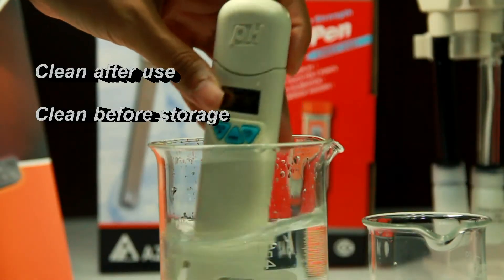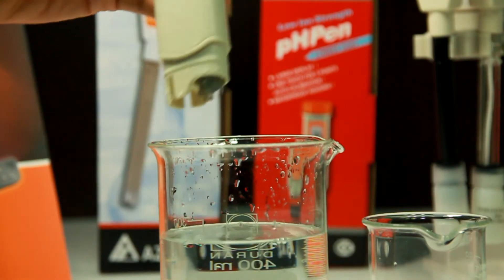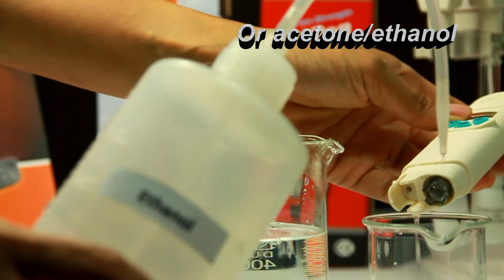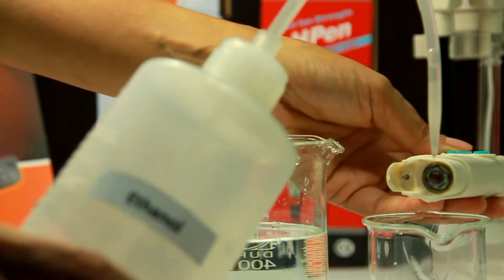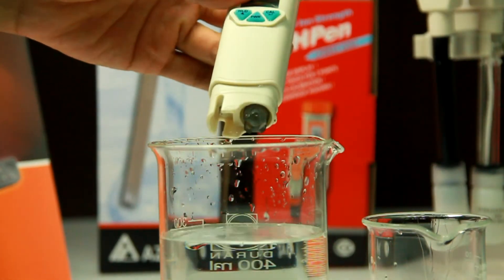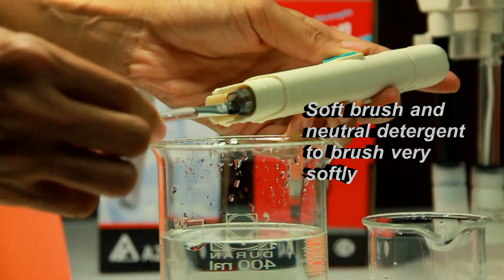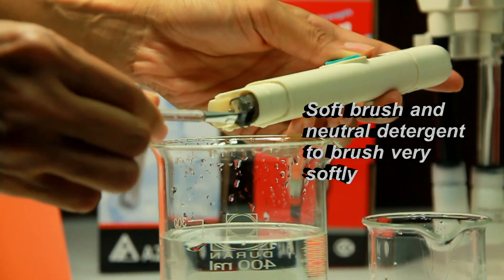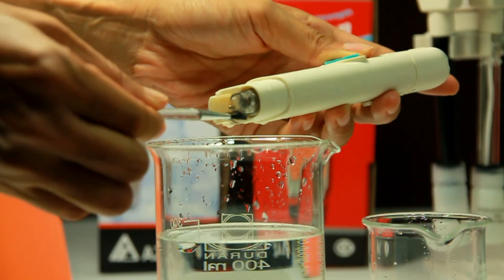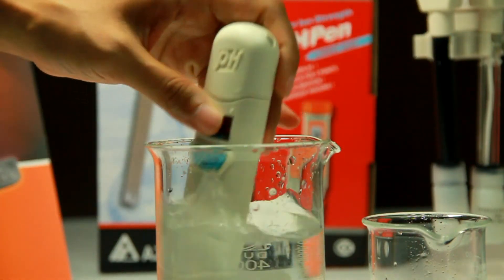Always clean the PH electrode before storage. You may use distilled water to clean and rinse the electrode. If necessary, you may use acetone or ethanol to remove attachments. If the probe is very dirty, use a soft brush and neutral detergent to brush very softly. After the cleaning procedure, always remember to use storage buffer to keep the electrode wet.